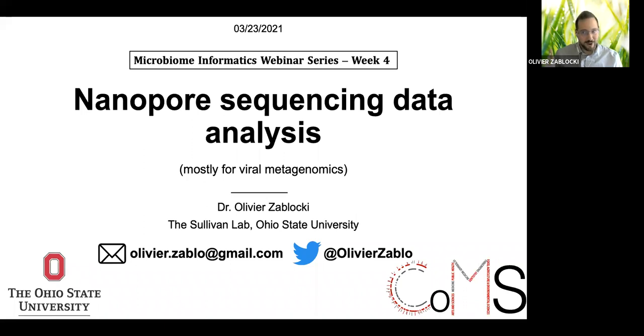I know this is yet another Zoom meeting, but I sincerely hope that today's lesson will be of good use to you as we go through the weeds of analysis with long reads. As you've probably guessed, today is going to be about nanopore sequencing data analysis, and we will frame this technology and the analysis of this kind of data in a viral metagenomic context, which has some specific problems that long-read sequencing can help solve.